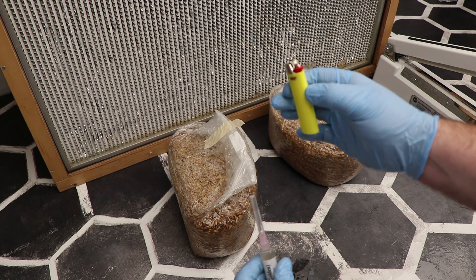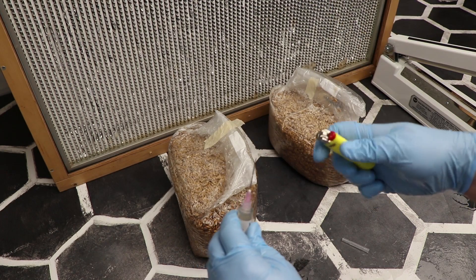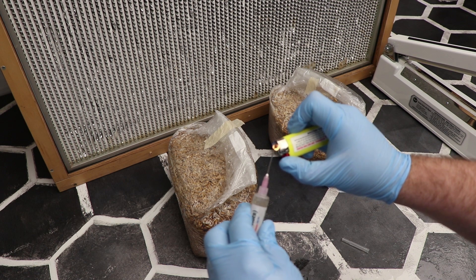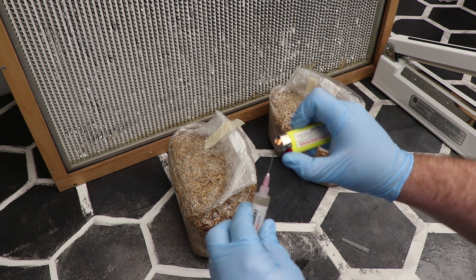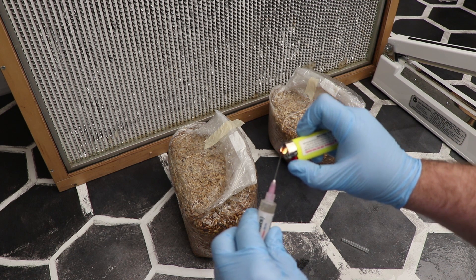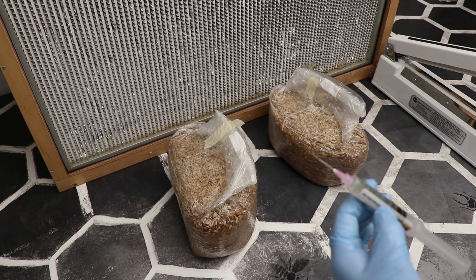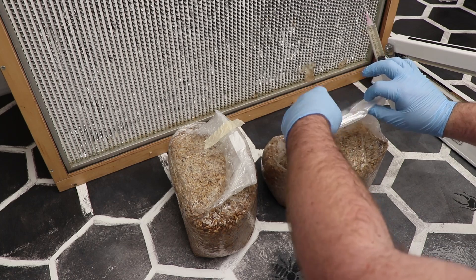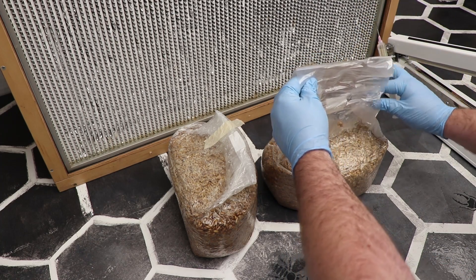I take my lighter, pull the cap of the syringe up, drop it — you're not going to need that. Light the lighter. You can do this with a propane torch, an alcohol lamp, or a lighter. I like the simplicity of a propane torch or a lighter — I get the end red hot. Once I have that, I take this and open my bag without ever touching the very top seam. As you'll notice, I open it up from the sides.